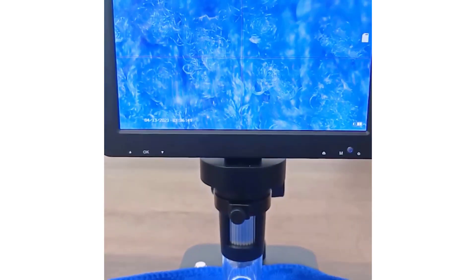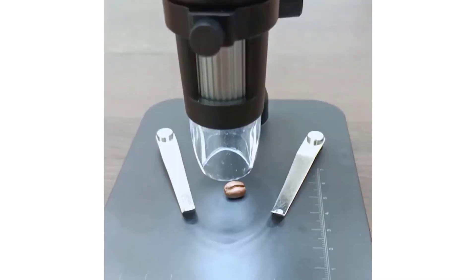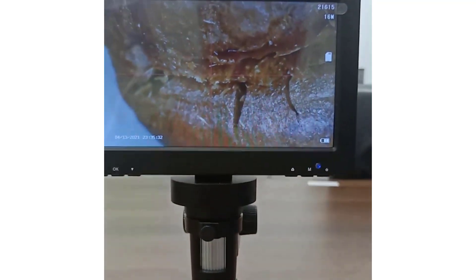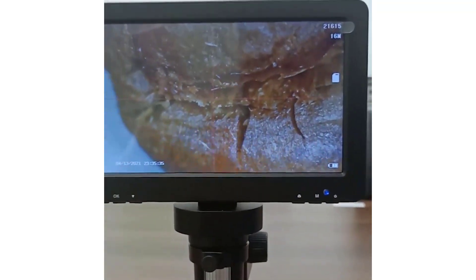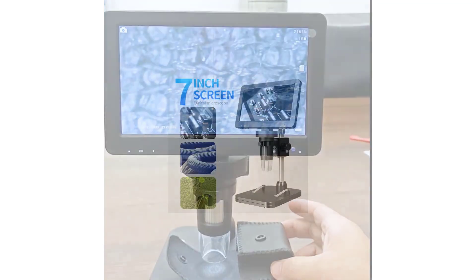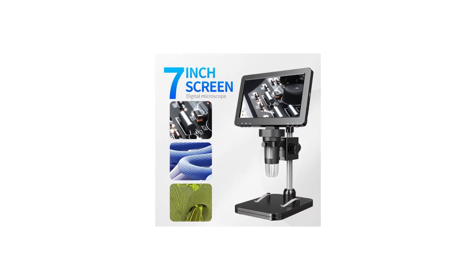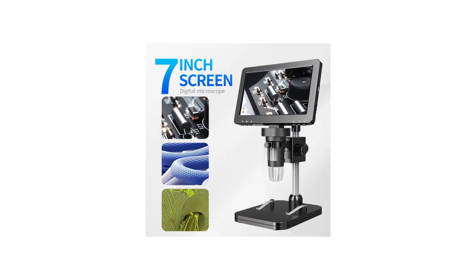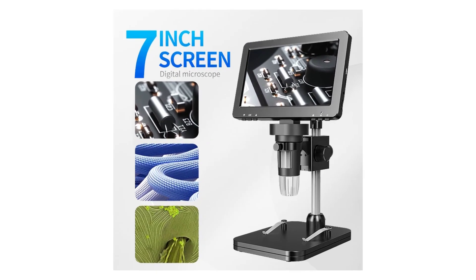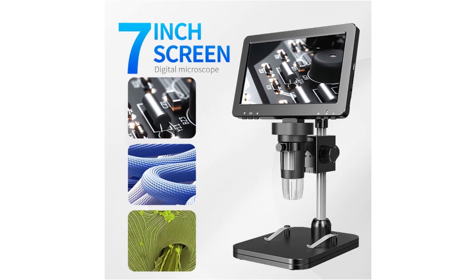One of the standout features of this microscope is its impressive magnification range, spanning from 500x to 1500x, allowing users to explore intricate details with clarity and depth. This makes it ideal for examining a wide range of subjects from coins and bugs to plants, rocks, skin, gems, circuit boards, and more.